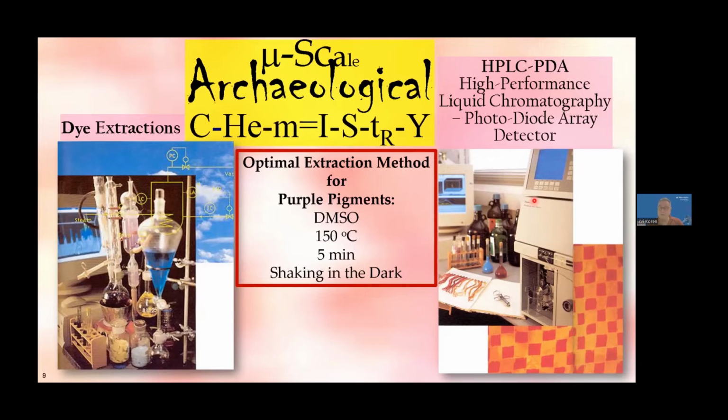But there's two things. I also put into this particular slide the optimal extraction method. Without going into too much detail, there are basically two things that those who are non-scientists have to ask themselves. And you museum curators, conservators, when you give over samples, is the right method being used for the right samples?